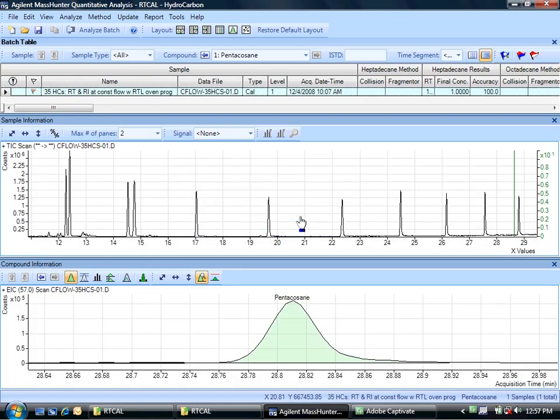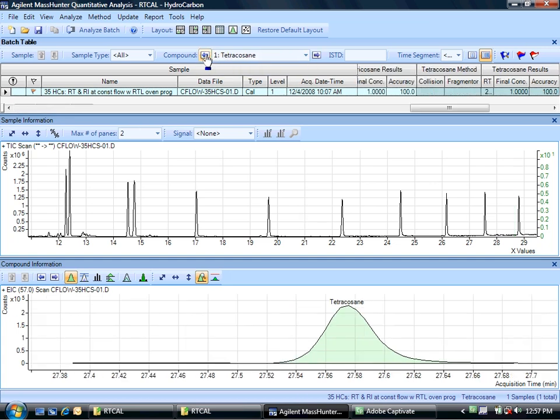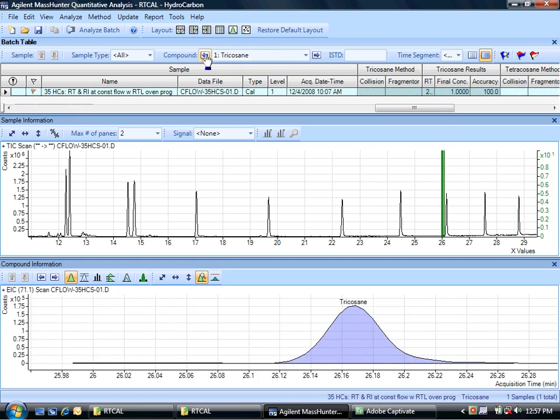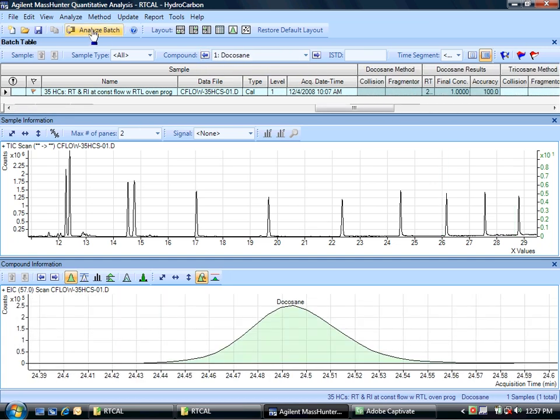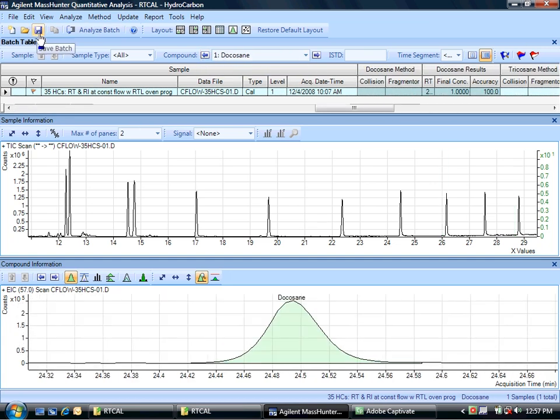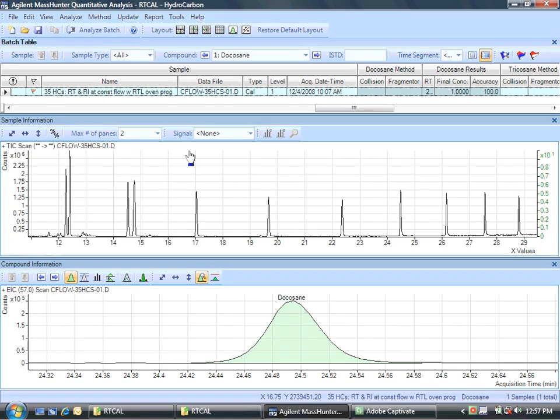With that valid method I can then apply that method to the batch. I've got a single sample batch and I can see here I'm finding all of those compounds. Now I will save that batch, and I've got what I need to move on to make the retention time calibration mapping.